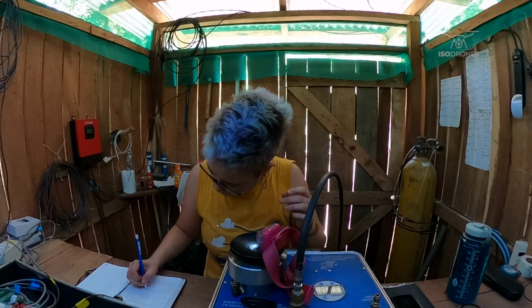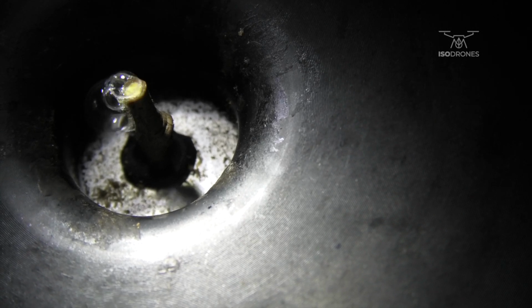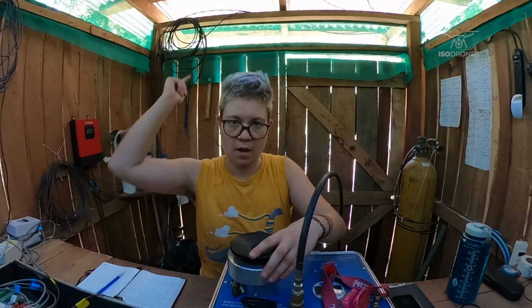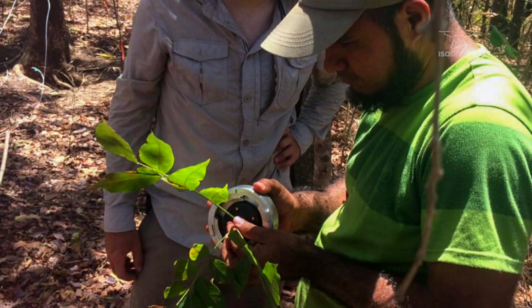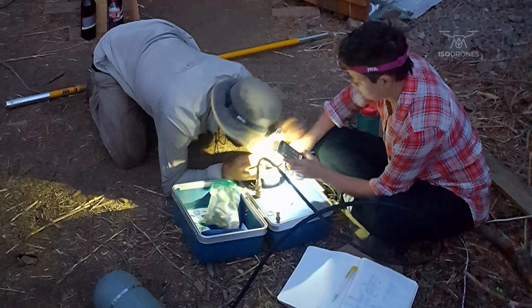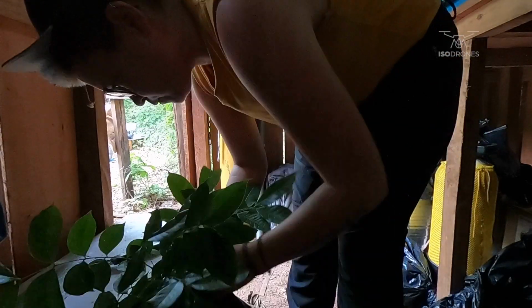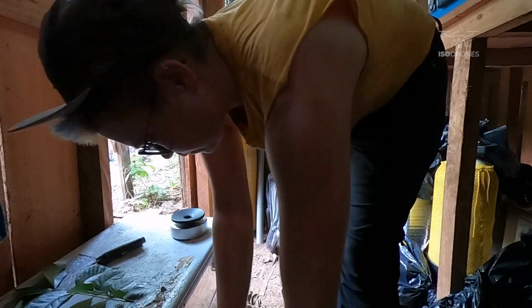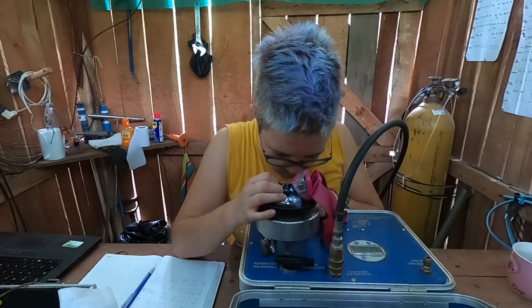When it's bubbling like that, you already went a little bit too far, but it's quite hard to film this, to be honest. Also, this is one of our easiest species. There's other species that have latex or some other etheric oils that sometimes make it really hard to distinguish those from water. So yeah, I was experimenting with this a lot.